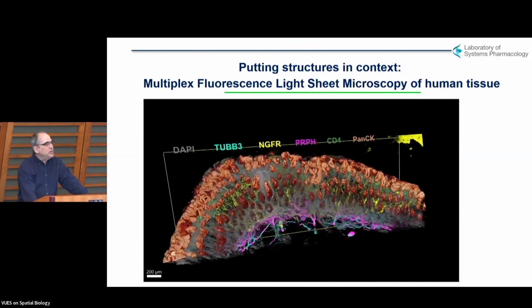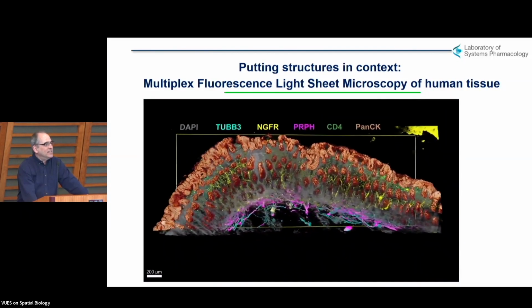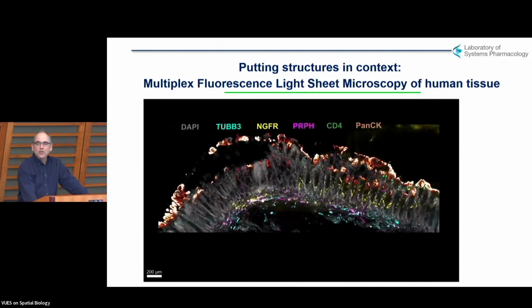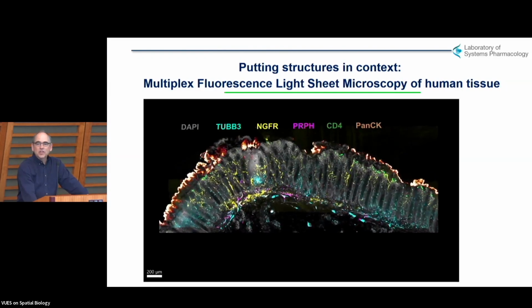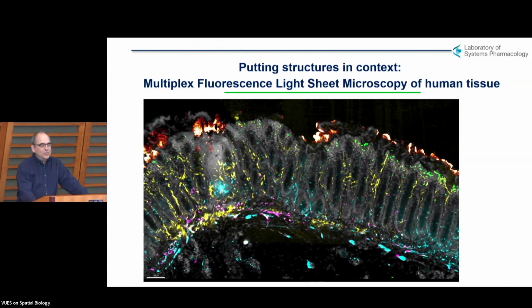And the way you do that is with a light sheet microscope, which has been around for 20 years. And the company that we work with here has sold several hundred, and not a single one of them is used, as far as we know, to collect data from humans. They're exclusively used to collect data from transgenic, or what I heard the other day, the administration calls transgender mice.